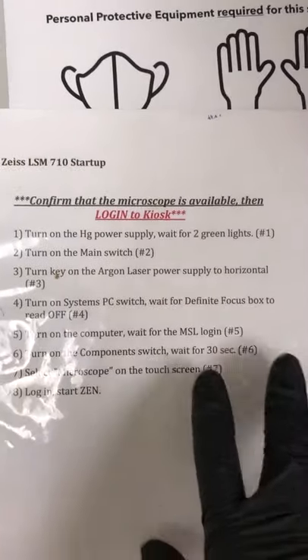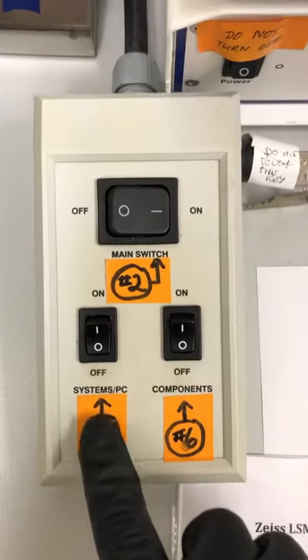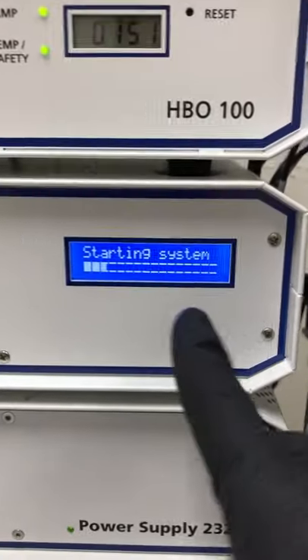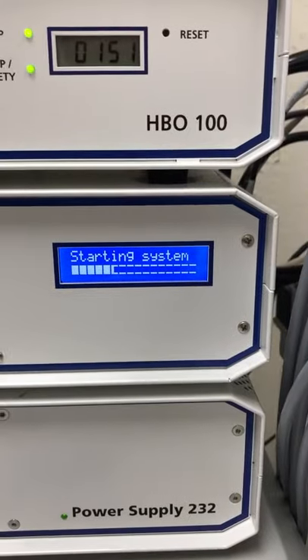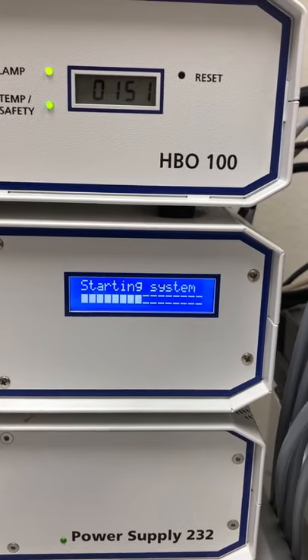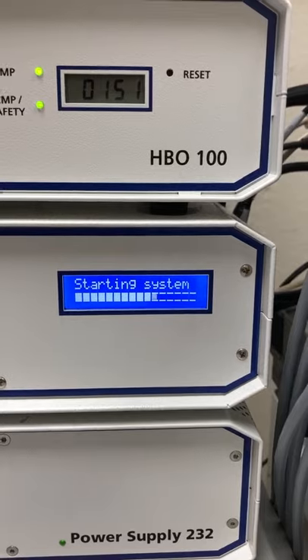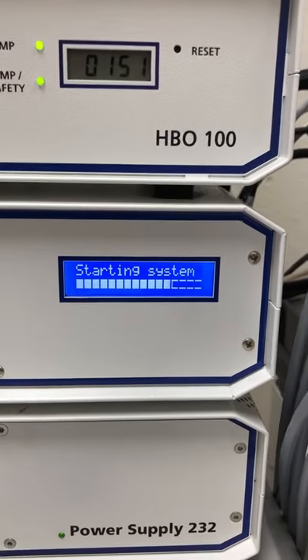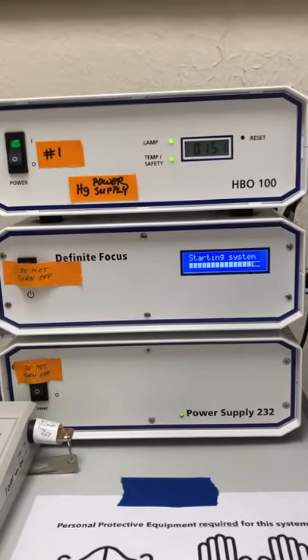The next step is to turn on the systems PC switch and wait for the definite focus box to read 'off.' This is the definite focus box — you can see it says 'starting system.' It will start different components, you can see the progress bar, and at the end it will say 'off,' which is confusing because we're turning the system on. It's because the last thing it checks is an optional component that it turns on, verifies, and then says 'off.' It should say 'ready,' but it says 'off,' and 'off' means we're starting it up correctly.